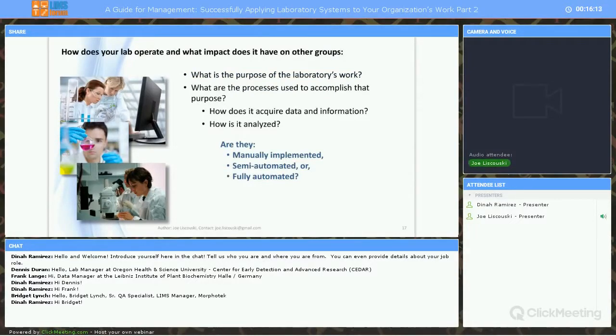The use of lab technologies can improve the processes that are used to conduct your work. There is a progression from manual to semi-automated to fully automated systems. In each case, there's a cost per experiment to consider. Manual work is expensive, but people are easily adaptable to change, particularly when methods may be updated frequently, or there's a low demand for some types of testing.